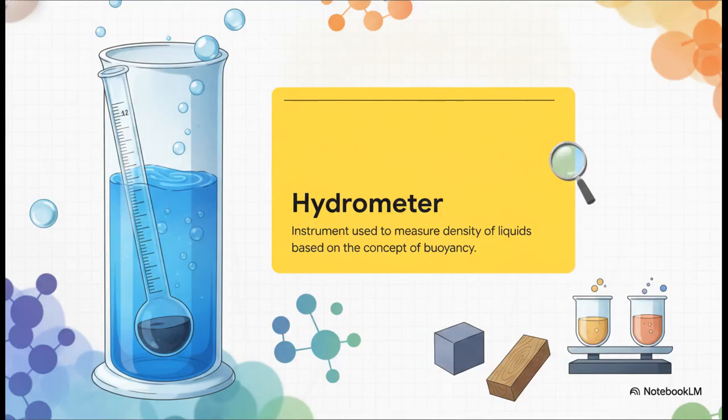And that brings us to one of my absolute favorite pieces of laboratory equipment, the hydrometer. Picture a sealed, hollow glass tube.